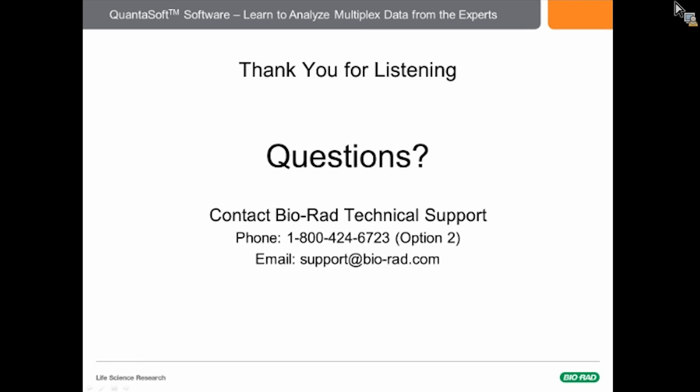The first question was on the slide where you indicated that there were 3 different concentrations for wild type and mutant. You indicated that there were 1 mutant and then 2 mutant. Could you clarify this just a bit more?